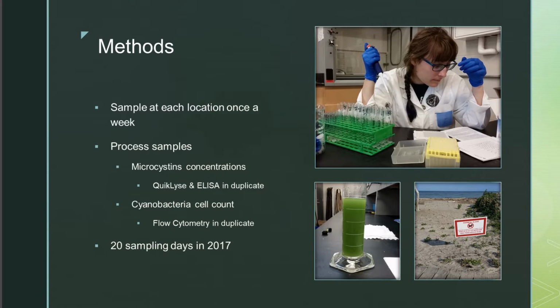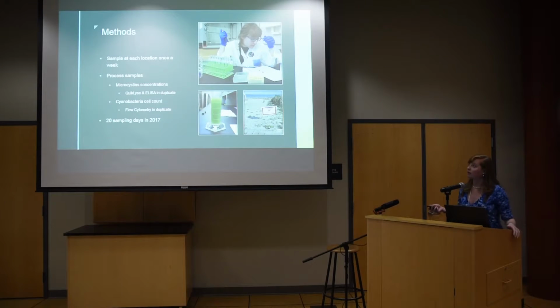So I said already that we sampled our locations, but we did it once a week, every Thursday, and we took the samples basically the same way that we take a bacteria sample. So you wade into the water waist deep, and then you stick your arms in elbow deep, unscrew your sterilized bottle, and then screw the cap back on and take it back to the lab and make sure that it's chilled in the process.